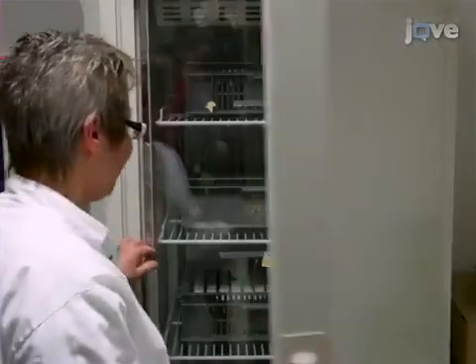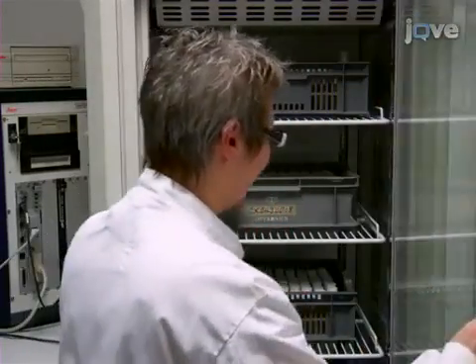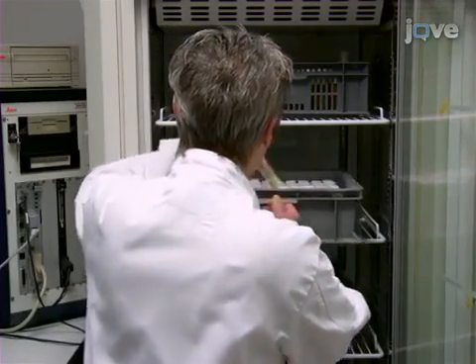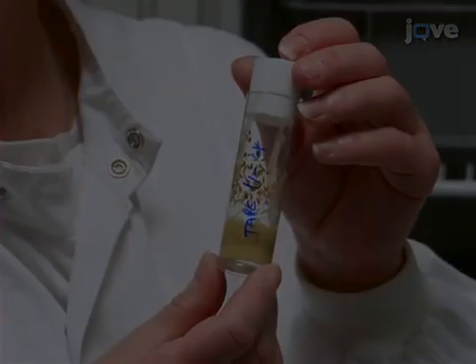Transgenic flies are maintained at 25 degrees Celsius in plastic vials containing fly food and with additional dry yeast powder on the top. The vial is routinely replaced every 2 days.